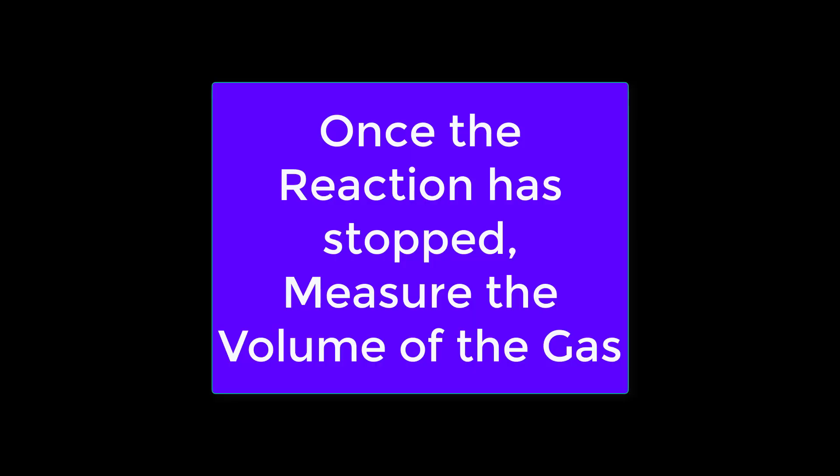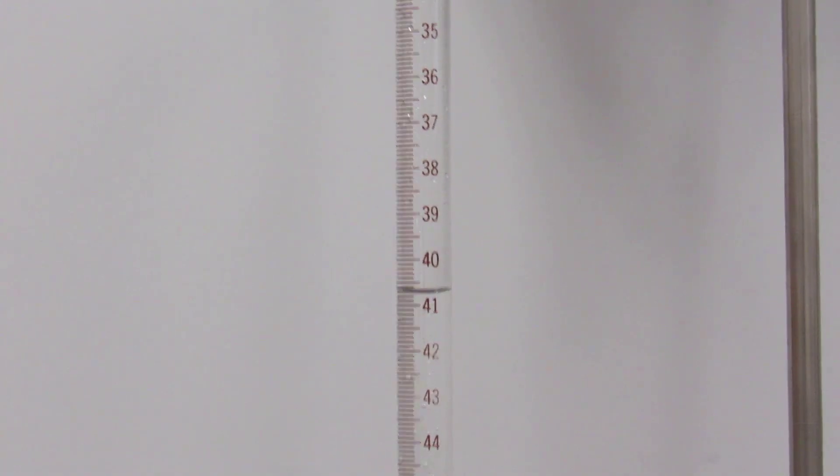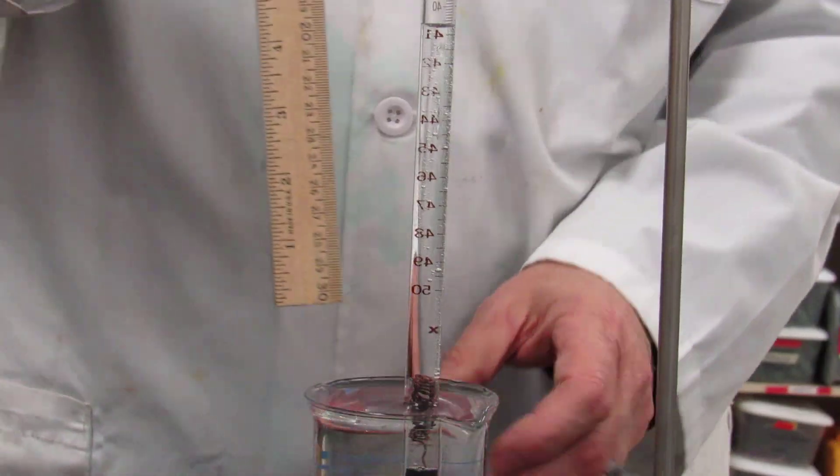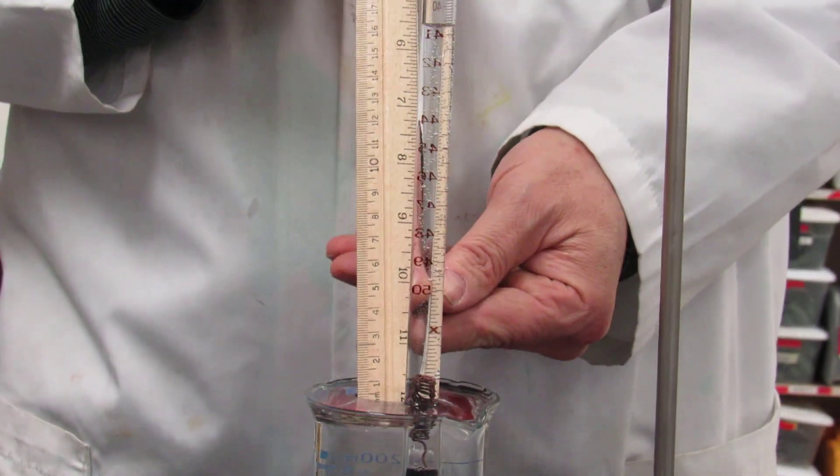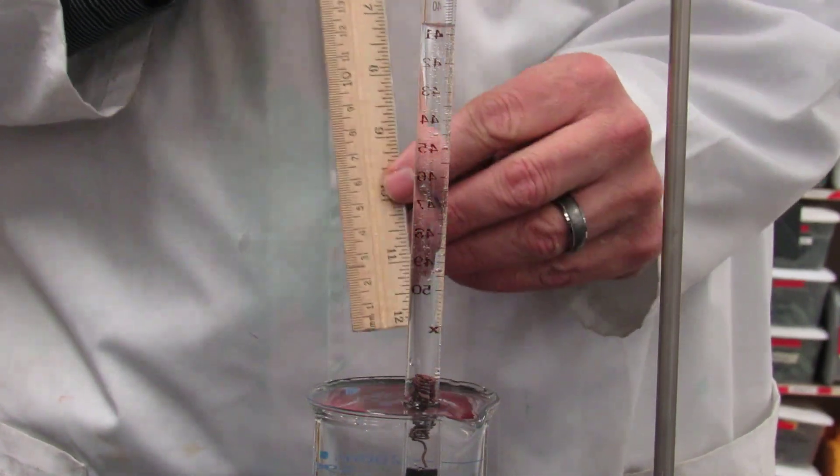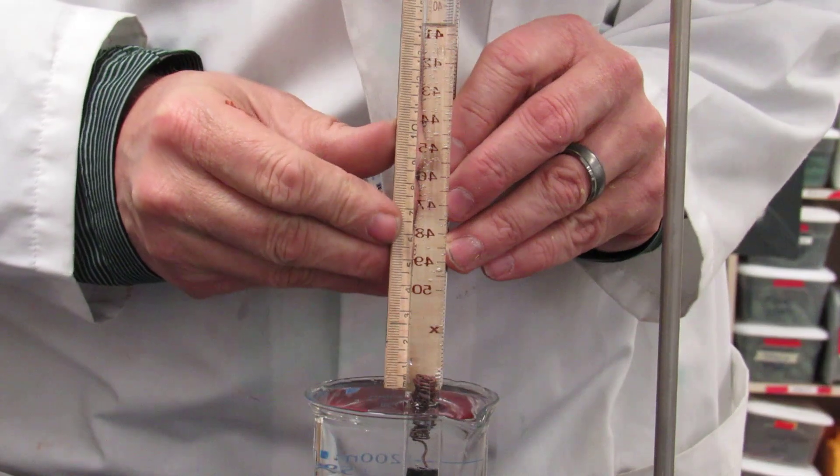Once the reaction is stopped, measure the volume. Use the eudiometer measuring from the top. And then finally, the last thing you need to do measurement-wise is measure the height of the water tower inside the tube. Notice that the level in the tube is not equal to the level in the beaker.